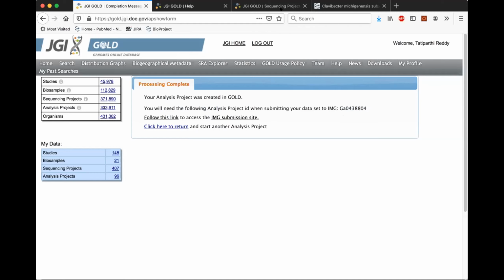Reddy, there was one question asking about the sequencing quality. How do you determine the sequence quality of your project? You had the pull down where it said finished, draft, or improved draft. How do you go about determining that for your submission?